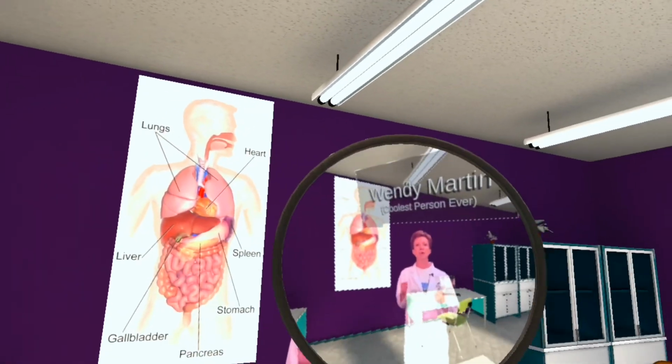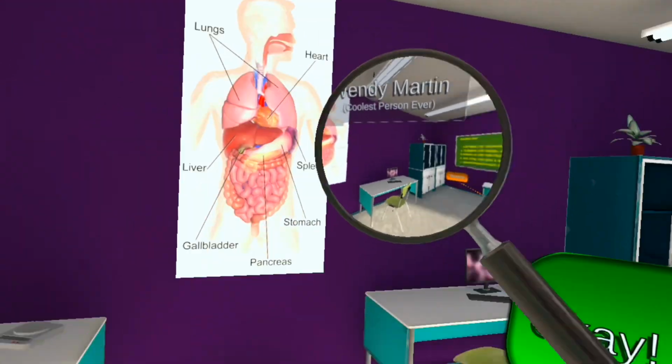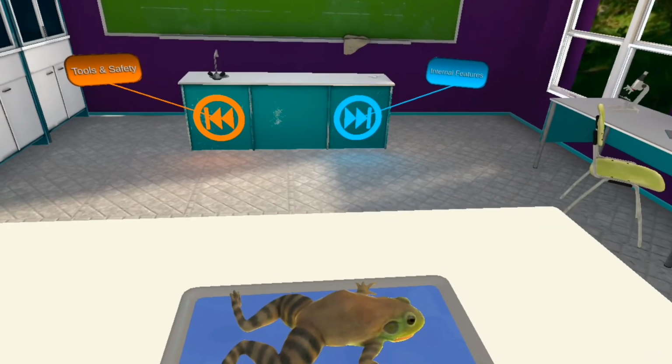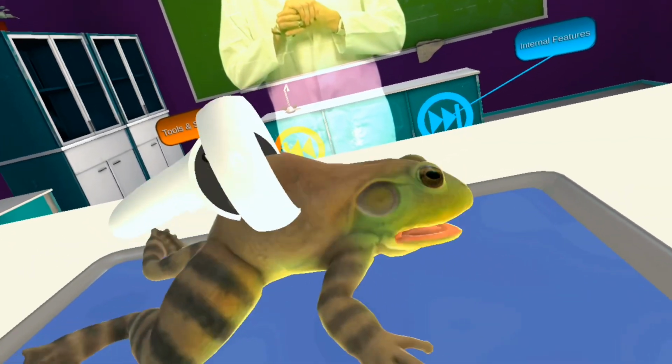For now, pick it up, hold it up, and look at me. I'm looking at you, Wendy. Looked at Wendy. Put that down. Okay, I've got it. Whoa, there's the frog. There he is. Okay, good job.